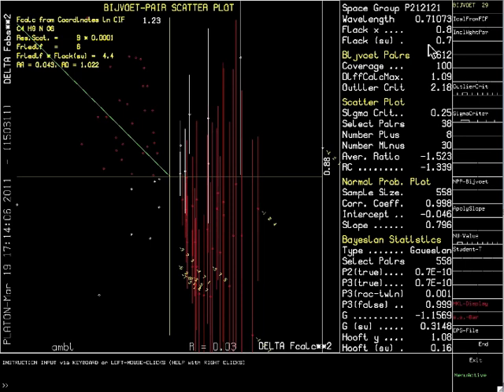What we are interested in here are the values below the Flack parameter in the rest of the right-hand column. In the measured dataset, there are 612 observed Bijvoet pairs, a completeness of 100%.